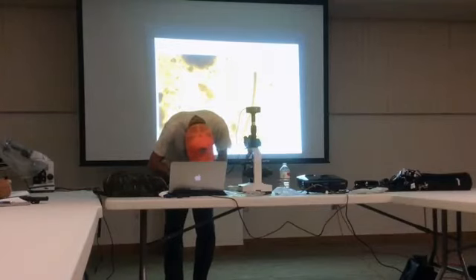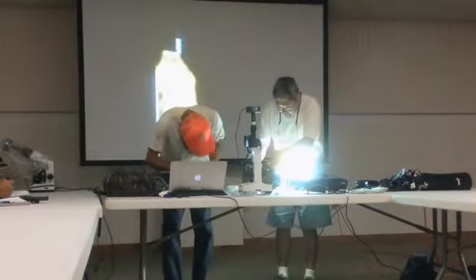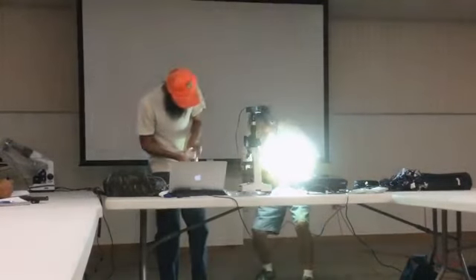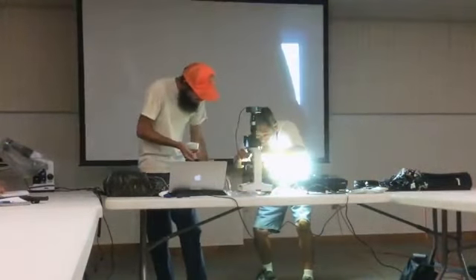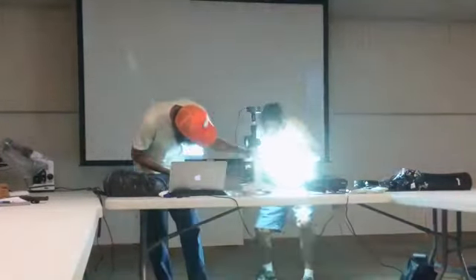You done with that slide? Yeah. Looking for it to probably slip. It's not shattered. Or you can lower it, so there's more space.